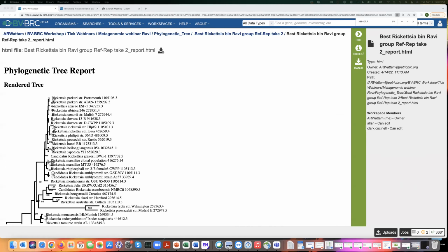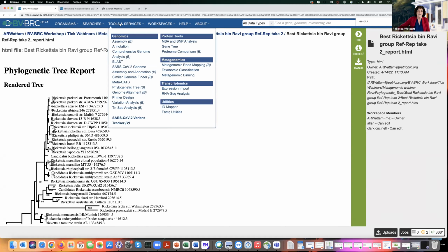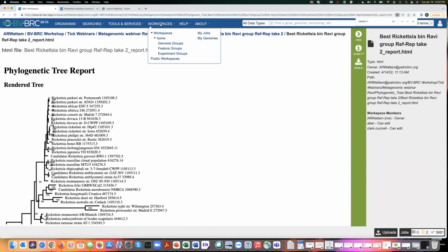And I think, obviously the quick answer is that, well, if you're sequencing 16S, then you're limited to 16S. Right. Yeah. You can build a gene tree with 16S data, but it would have to be annotated within the system. So I would have to go into those genomes, click on, well, I can show you how I would do it. While you're doing that, she could, obviously maybe not within BV-BRC, but she could take her 16S data and generate a tree using a separate tool, right? With some kind of an alignment. We do have gene tools to be able to do that.